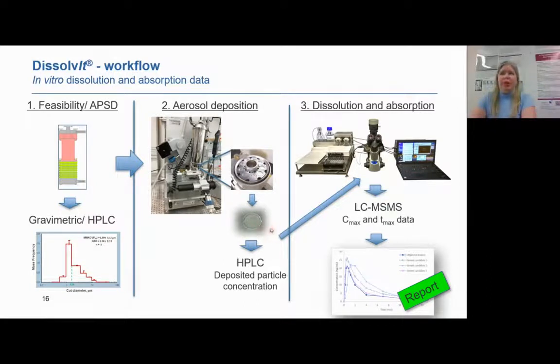to find out if the amount of analyte is as we want it to be. Especially if you're going to compare some formulations, then you want to have the same amount of analyte in the different formulations, so you need to do some kind of dose estimation before the experiments. But then you still have 6 glass cover slips left, so you have enough to do dissolution experiments. Usually we use 3 of the glass cover slips to perform the experiments in triplicate.